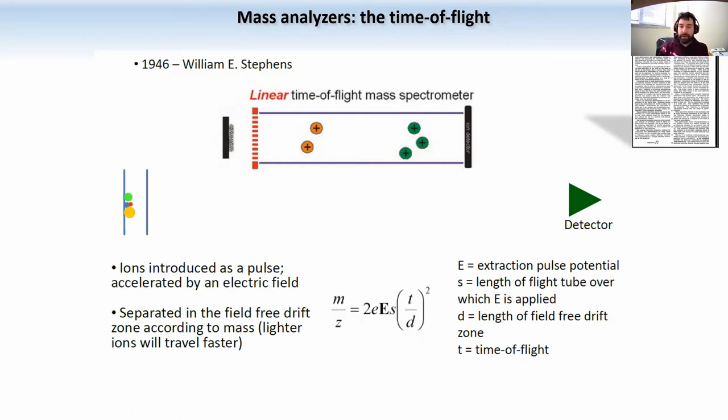a very high vacuum. So there's no air inside, right? Because otherwise the molecules will collide and break. So the molecules are being shot in this tube, and then at one point they hit the detector. Now, what is interesting about that is that the instrument knows when it's shooting the molecules, and then the detector defines when this group of molecules hits the detector, right?